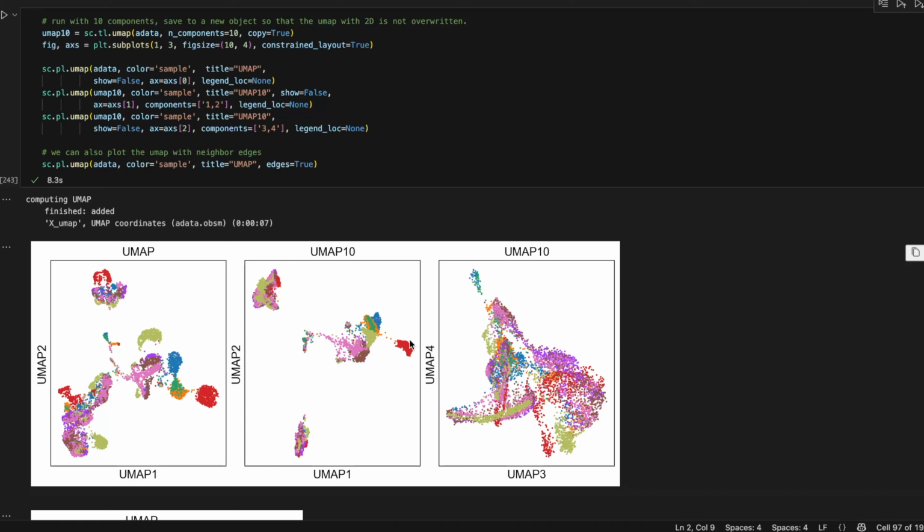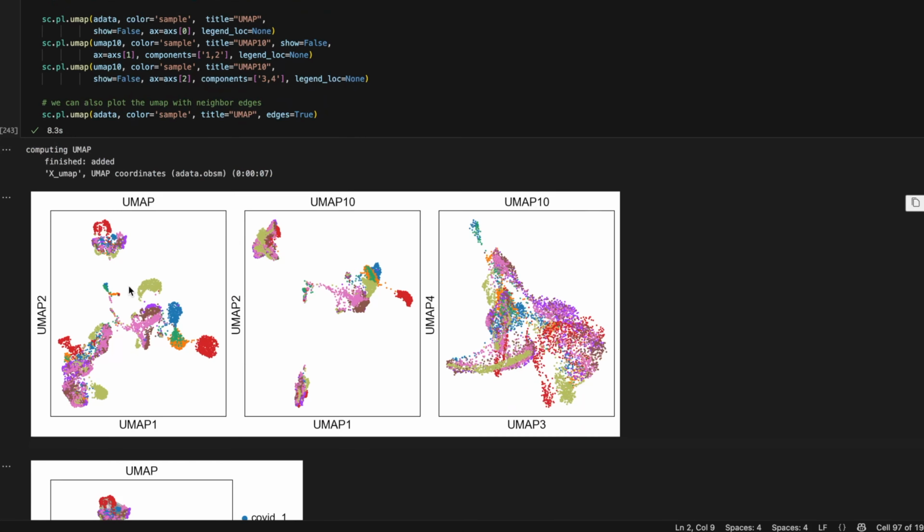While higher dimensional embedding can preserve more of the global structure, the added complexity can also introduce a bit of noise, which you can see here as well. It can become relevant for machine learning purposes, but not necessarily for visualization. So we go with the default number of components, which is 2.